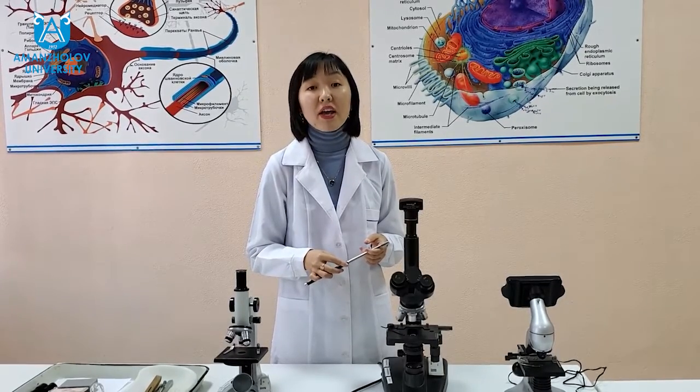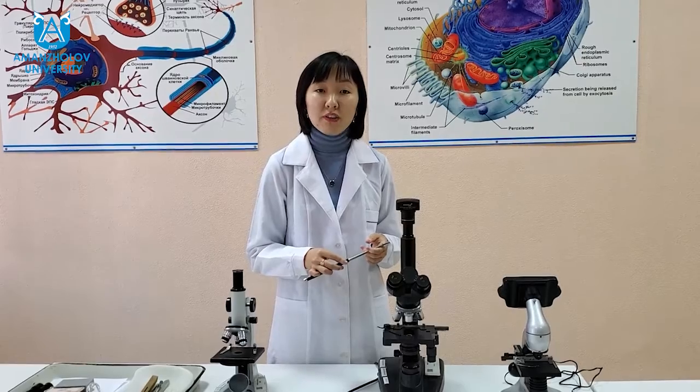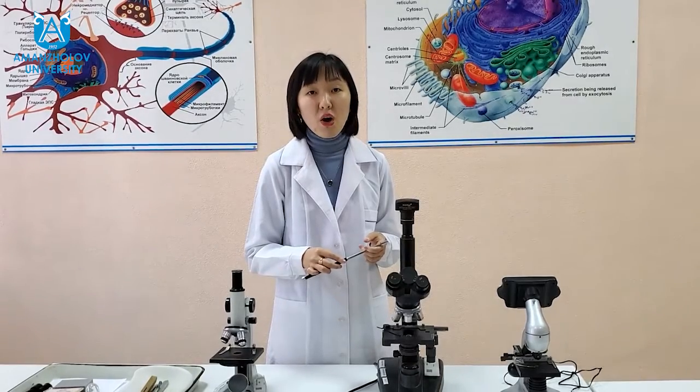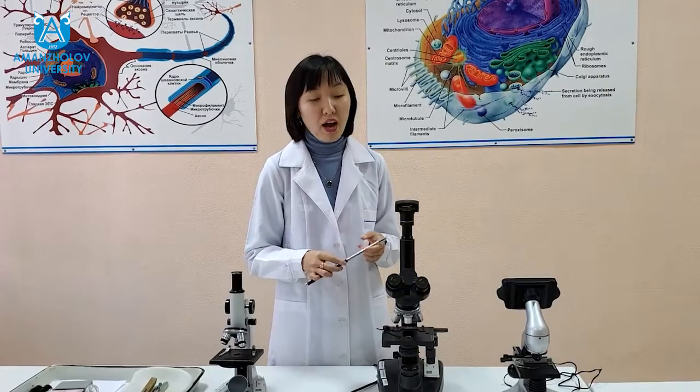The objective consists of a frontal part and a subsequent part. The frontal lens faces the specimen and is the primary imaging tool. The subsequent part, in combination with the frontal part, provides the required magnification, focal length, and image quality, as well as determining the length of the objective and the length of the microscope tube.